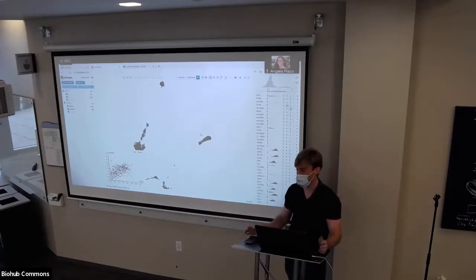This is kind of useful for seeing how correlated is a gene that you have newly discovered with like a marker gene that you know about. And so this is super useful. And we hit remove at the top right of that to close it.